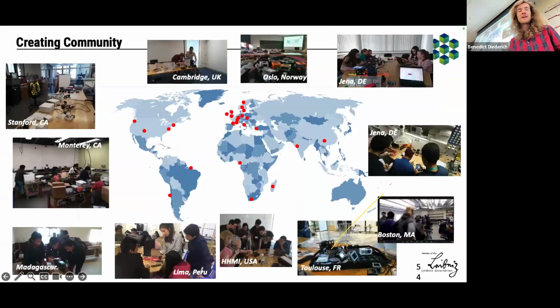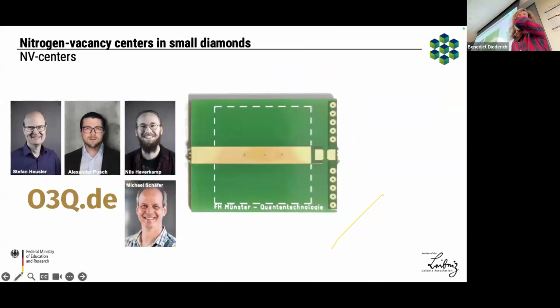Yeah, many people everywhere. I think there were some people here in this room 3 years ago. So I should maybe take a new picture. My backpack is still somewhere. Oh, it's here. Right. So the branching. Some people unfortunately were only men, but now there are also some more women involved. They have taken one of our stages from years back with this click mechanism of the magnets and based their quantum experiments on top. They are very much specialized in building educational material.